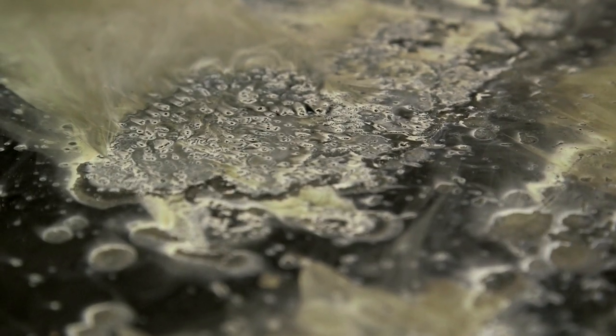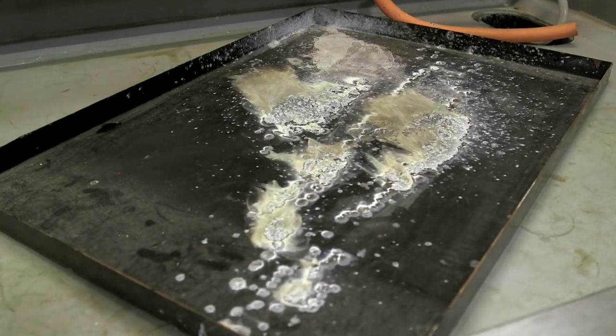In fact, that's not true because I've rerun Franklin's experiment. What happens is that you generate a massive cloud of steam. So what I think happened is that Franklin bottled it, put a couple drops in, saw this huge quantity of white steam vapor coming out, and at that point he just threw the flask away from him. As you've seen, it's the contact with the air that generates the blue flame. He suddenly got a massive increase in surface area, and that's what led to the beautiful blue flame.